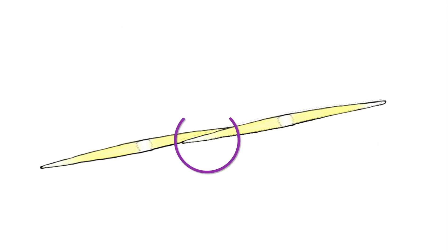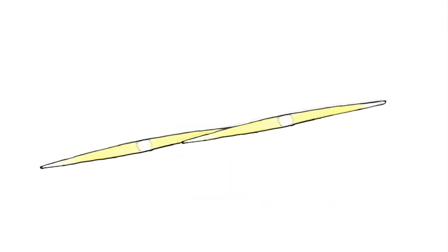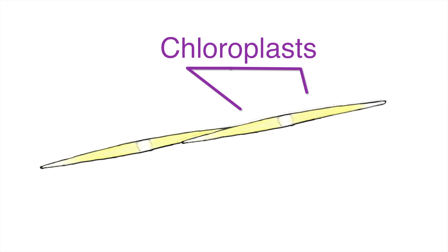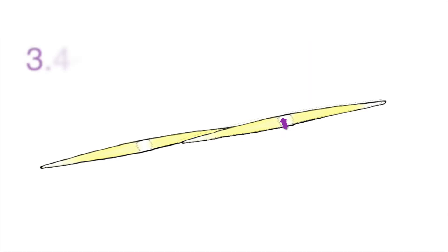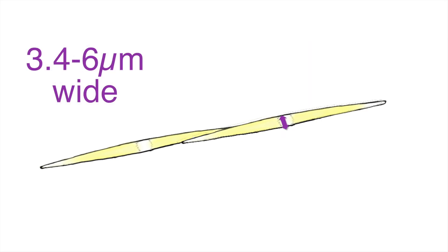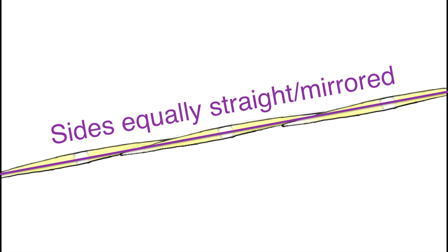Cells in chains overlap about one-fourth to one-third cell length, and, like all other Pseudo-nitzschia species, their two chloroplasts are golden brown in color and are located on either side of the central nucleus. This cell type is 3.4 to 6 micrometers wide, 68 to 140 micrometers long, and both sides of the cell are the same, both appearing generally straight.